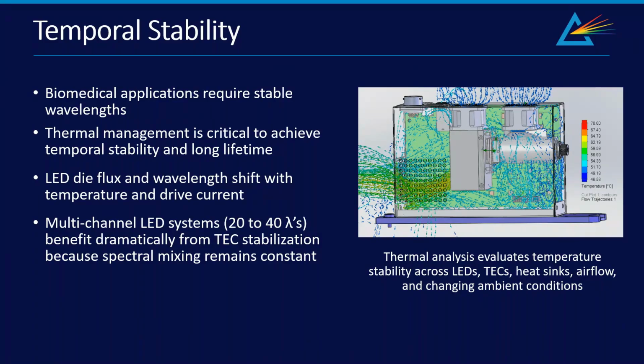In high-power systems, TEC stabilization can help maintain more consistent junction temperatures, spectral balance, and multimodal imaging repeatability across changing operating conditions. The thermal analysis shown here illustrates how LEDs, TECs, heat sinks, and airflow and ambient conditions must all be considered together within modern biomedical illumination system design.